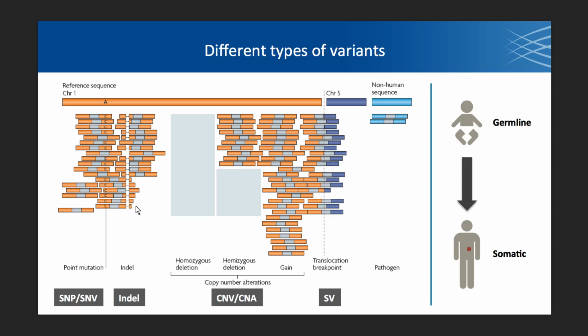Indels, which is sort of a short name for insertions and deletions, are going to span multiple bases, either with respect to the reference or the reads that you're sequencing. And what we have illustrated in this diagram is a deletion, so that if this is the reference, there are a couple bases here that are not represented in our reads.